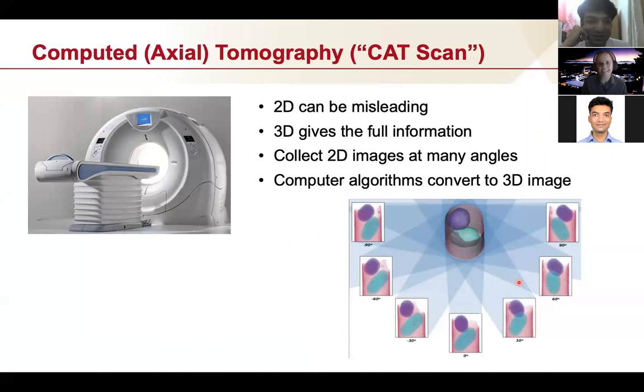So the way that 3D imaging is done in the full field microscope is tomography. It's basically a CAT scan. It's computed tomography. So we take images at many different angles of our sample. Unlike medical CT, we rotate our sample. You don't want to rotate your patient, and it's really hard to rotate a synchrotron. So we use essentially the same computer algorithms to convert your 2D projection images at different angles to a 3D volume of XYZ. And then you can take that volume and really rotate it, slice it, and dice it any way you want to see what's inside.